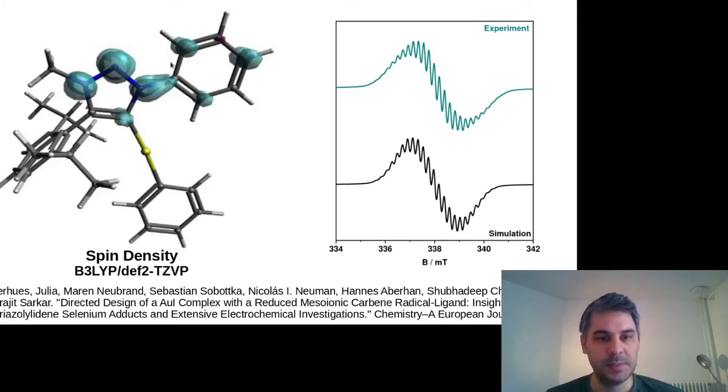This is a spin density plot that shows that the 3 nitrogens have similar, although not equal, spin densities, and also spin density on the ortho and para hydrogens. The spin density on the methyl groups is not observed at the ISO value this was plotted, but there's some spin density here that causes the hyperfine splittings from the hydrogens.